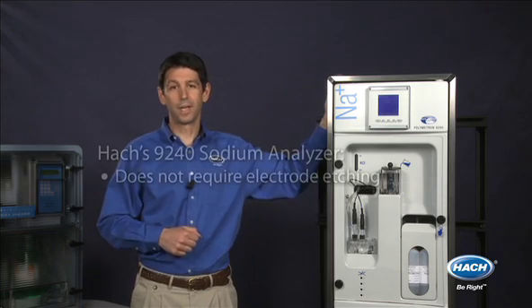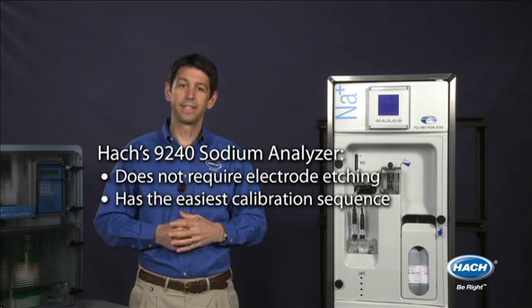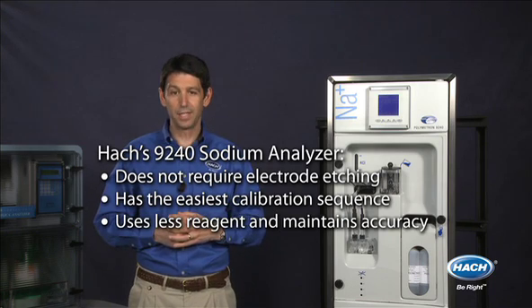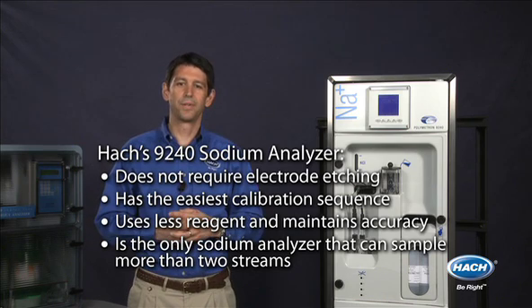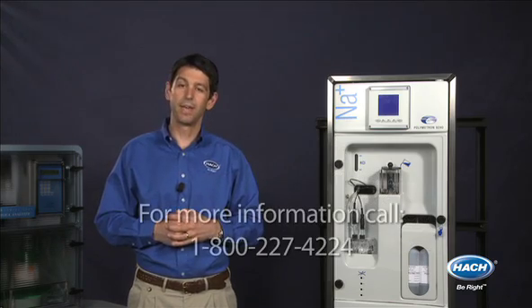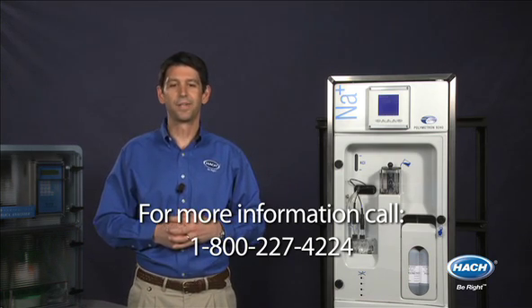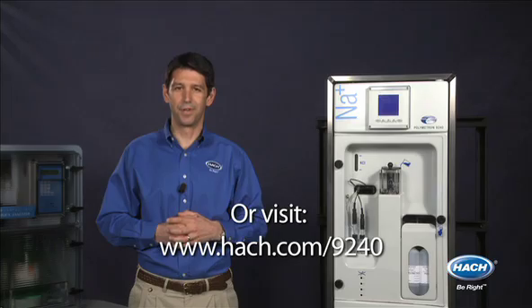Consider the 9240 because it's the only sodium analyzer that does not require electrode etching. It has the easiest calibration sequence of any analyzer, it requires less reagent and still maintains accuracy, and it's the only analyzer that can sample more than two streams. For more information on how the 9240 analyzer can save you time and money, contact your local sales representative at 1-800-227-4224 or visit hach.com/9240.